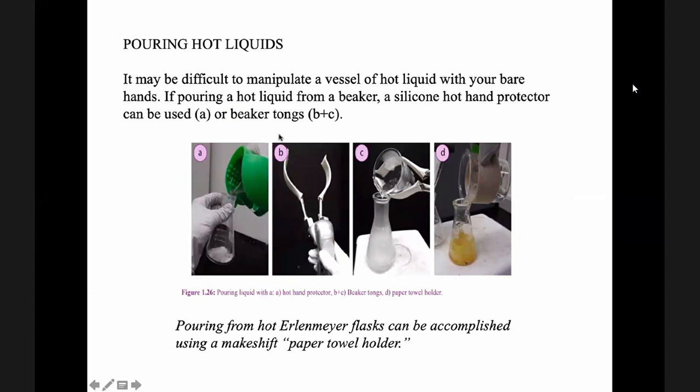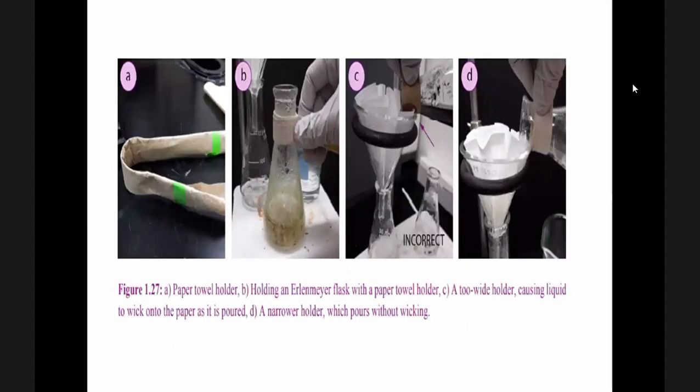Next, pouring hot liquids. So this is the technique. You know, we use here a hot hand protector. Have you seen this one? Or you can also use beaker tongs or a paper towel when dealing with hot liquids. Okay, same also.